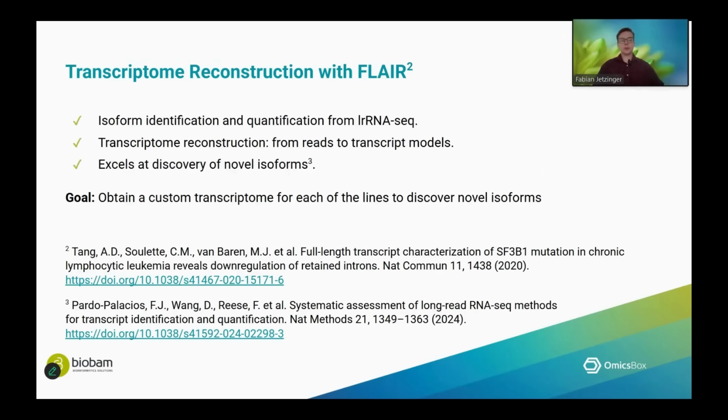Now, to go into a bit more detail on all of the different tools that we will be using today, let's start with the first step, transcriptome reconstruction with FLAIR. So FLAIR will help us to identify as well as quantify both known reference as well as novel isoforms from our data. So this step of transcriptome reconstruction will go from the reads all the way to transcript models, to a transcriptome.